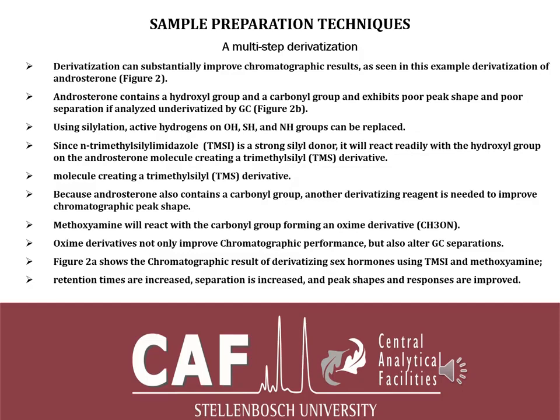Using silylation, the active hydrogen on the OH, SH, and NH groups can be replaced. You can use any silylating agent like BSTFA; MSTFA is a strong silyl donor.